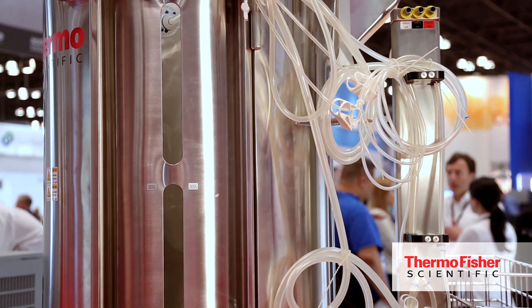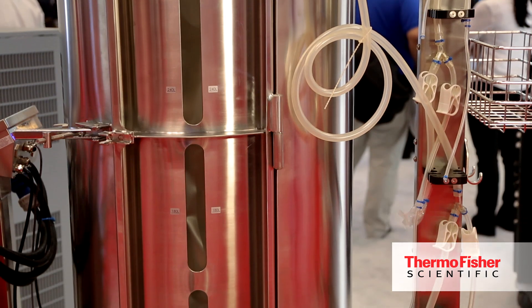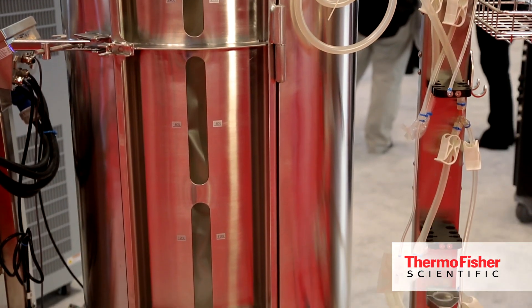As of now, we have released 30-liter and 300-liter sizes into the market, and depending on the response, we are looking at even larger sizes. You can go to thermoscientific.com/bioproduction where you have all the information related to this product, along with a video and all the product features.